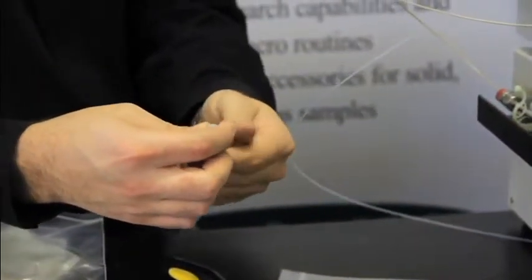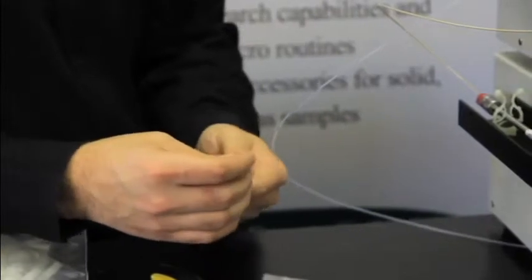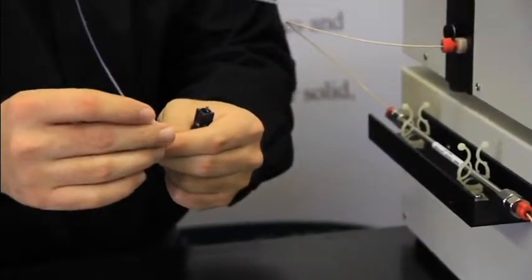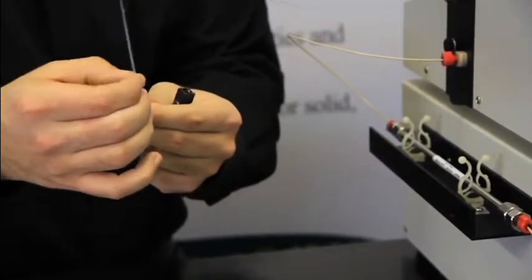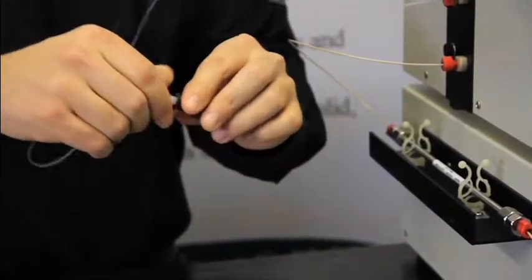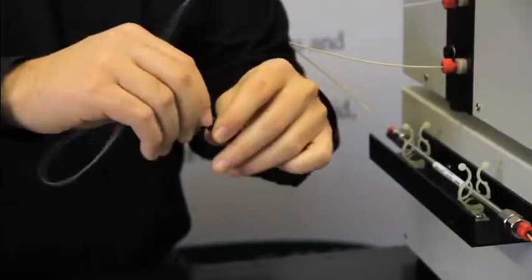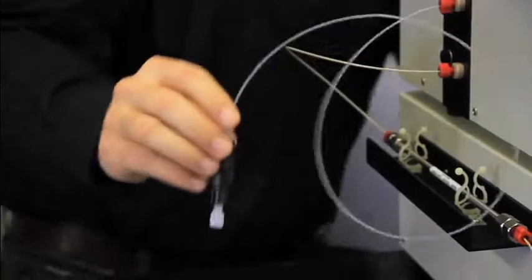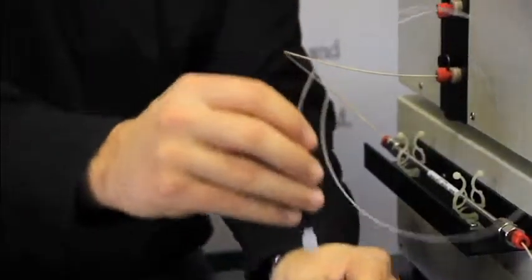So we're going to connect the tubing from the flow cell to the appropriate side of the back pressure regulator. Feed the tubing through, push the fitting in, and finger tight it down. This can now go in a waste container.